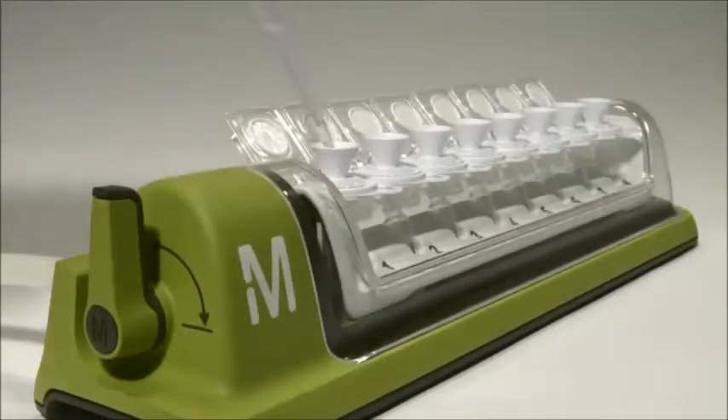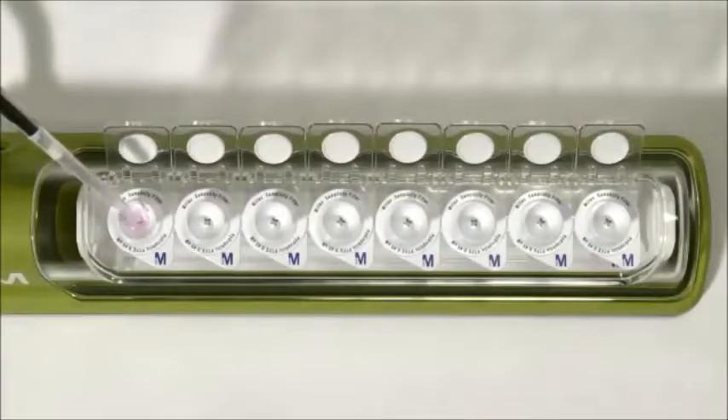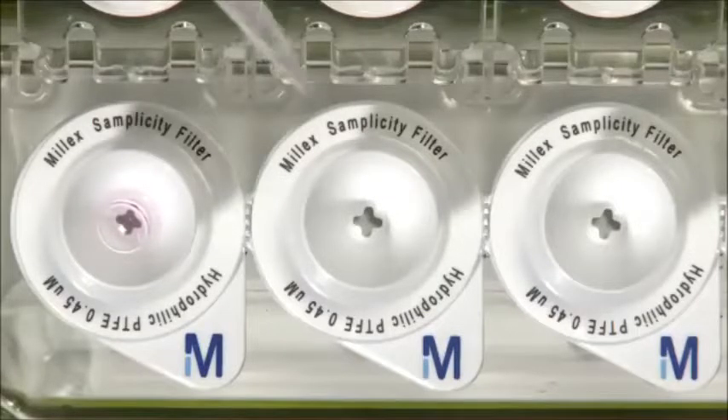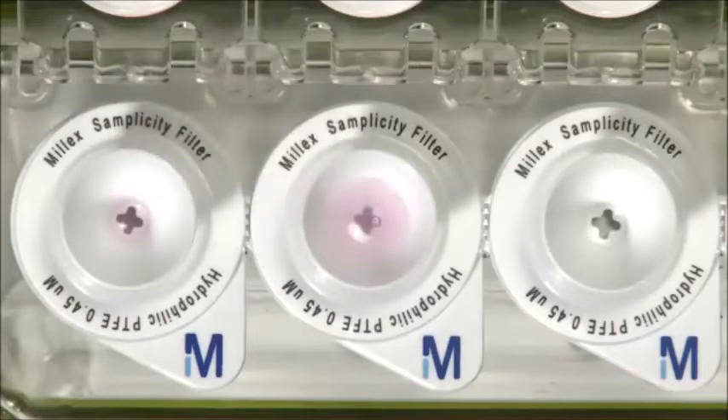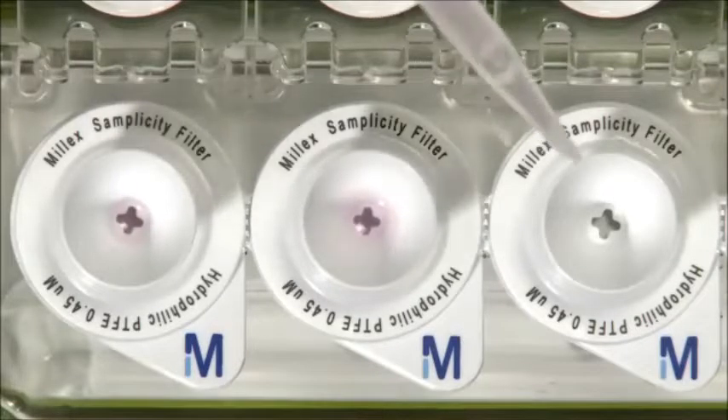Add samples to the conical filter funnels. You can add up to 2 milliliters of sample, which is the maximum capacity of the HPLC vial. Because the Simplicity system is vacuum driven, you recover considerably more sample volume than you can with a syringe.